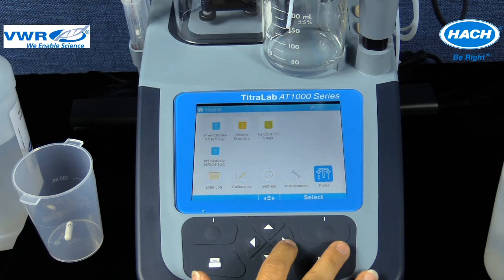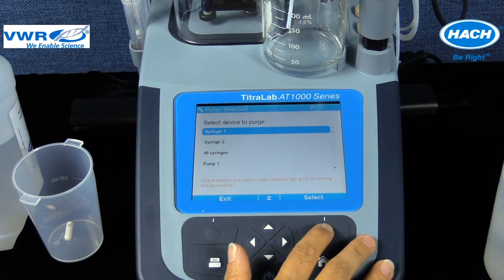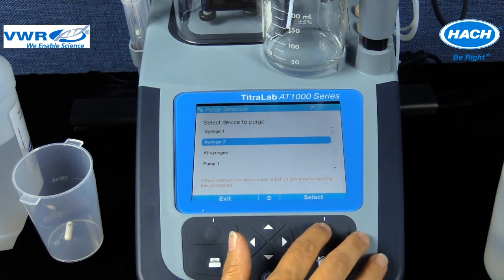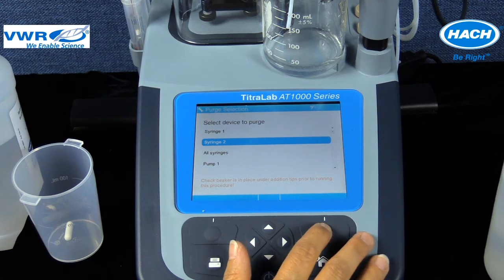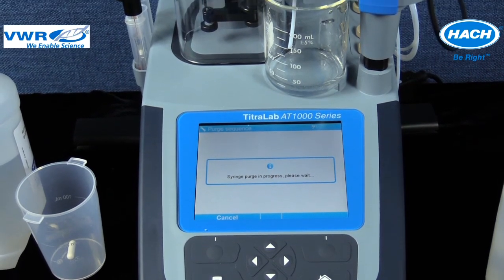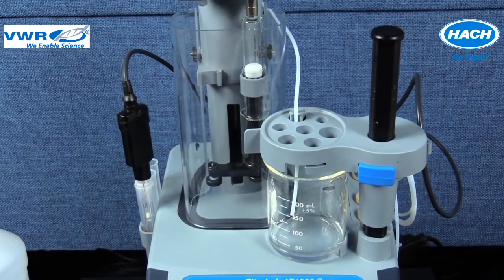The purge function is located on the home screen under the purge icon. Place a waste container under the sensor holder and select the correct position for the syringe that needs purging. In this example, syringe 2 will be purged to correspond to the syringe connected and application loaded. The software will activate an internal valve to open the syringe that is selected and close the valve for the syringe that is not selected.